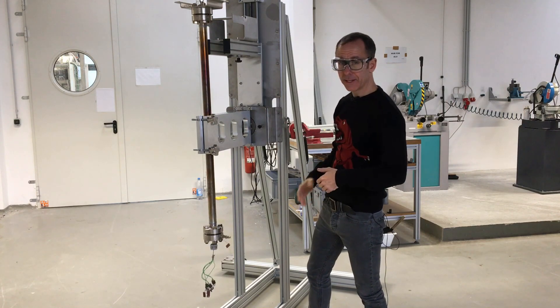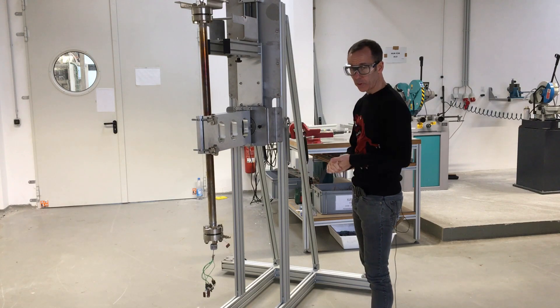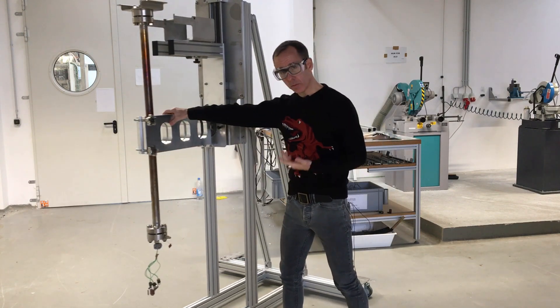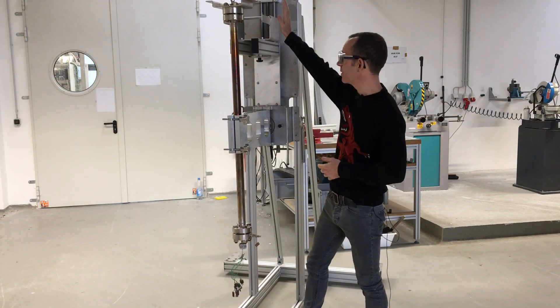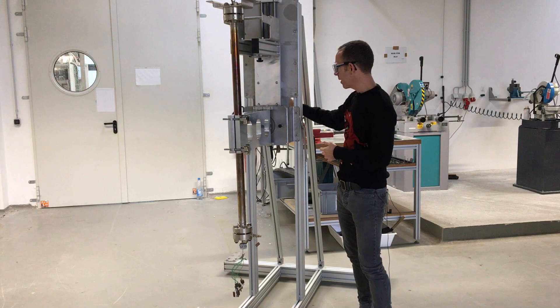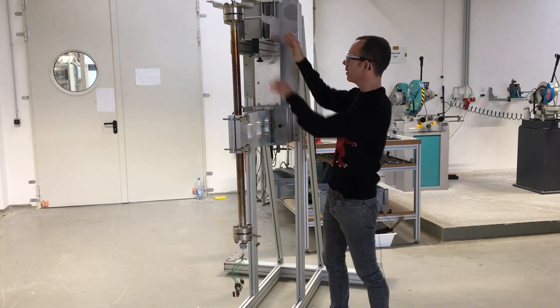It looks a bit like a guillotine but instead of chopping people's heads off we use it for transporting reactors about. It's located on wheels, so you can see it can be moved easily from one point to another. Basically what you have is a sled at the top with a raising mechanism, so we can push this sled into the split shell oven.